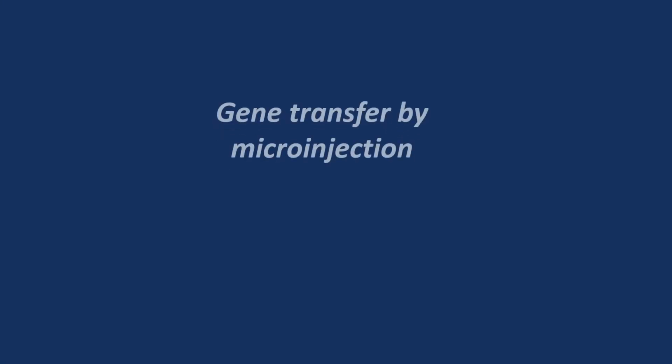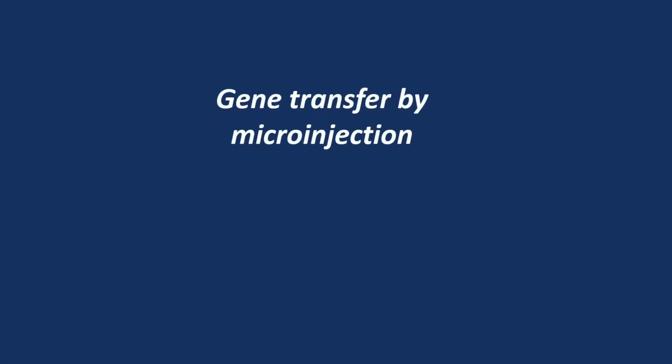Secondly, let's look at gene transfer by microinjections. In this article, we will find out that there are 2 microinjections that have been done. Firstly, pre-microinjection, for testing purposes, and the second one will be the actual microinjection. Now, let's look at pre-microinjections.